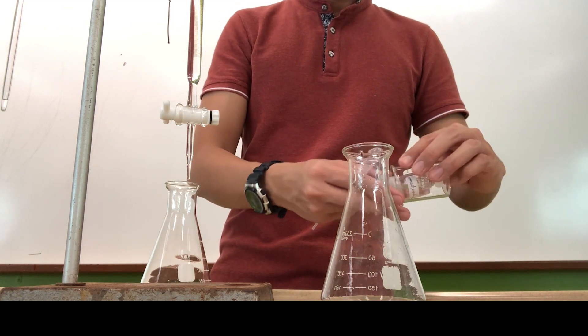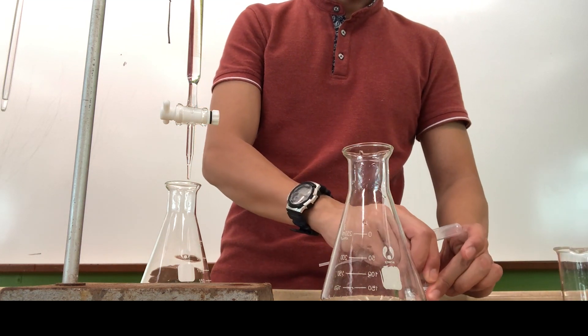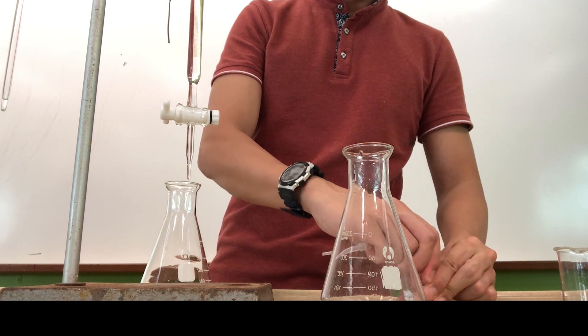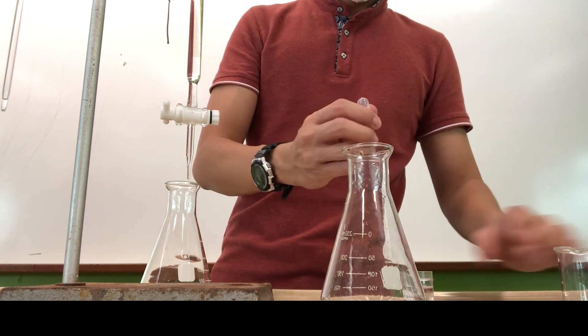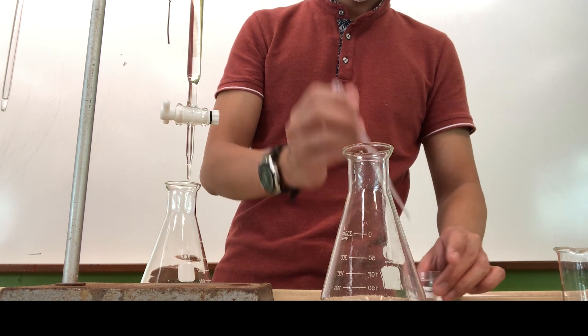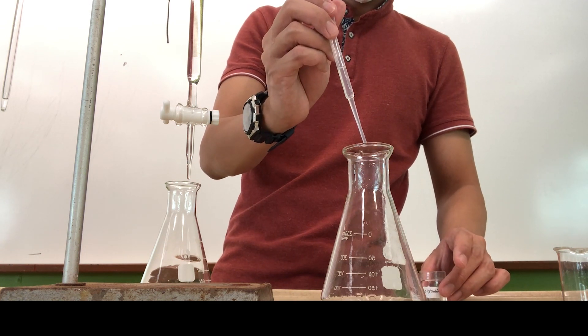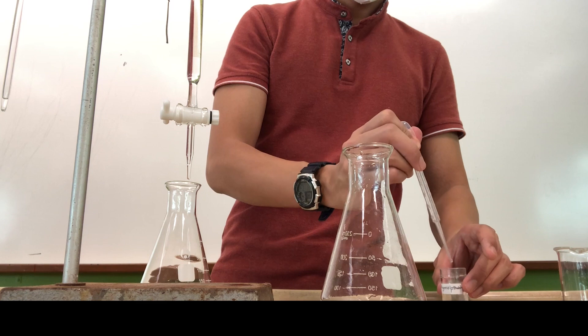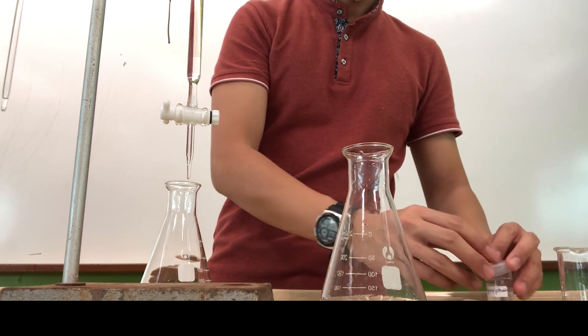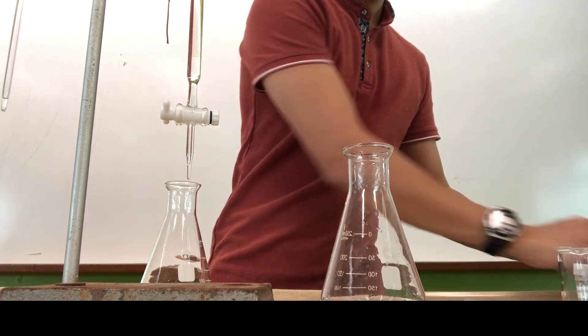Now we are going to put in the indicator. So for thymolphthalein, just like all your other indicators, you only need about two to three drops of it. And when you add it in, do take note of what is the original color of the indicator in this solution. As you can see over here, thymolphthalein is actually colorless in the solution of an acid.